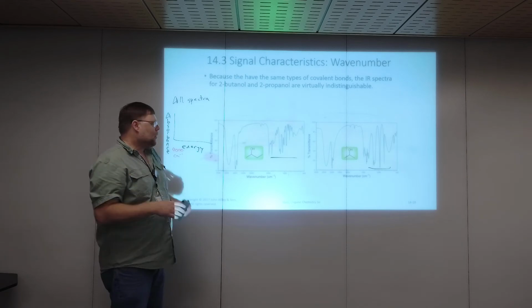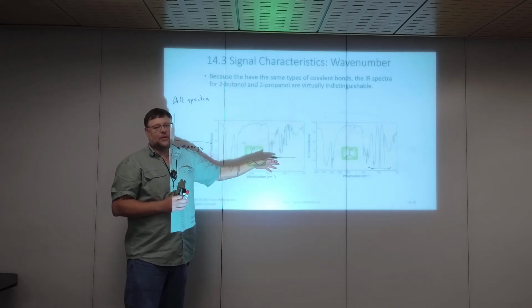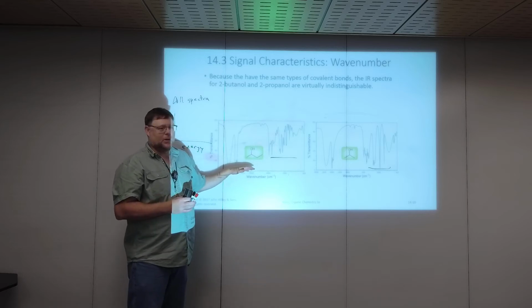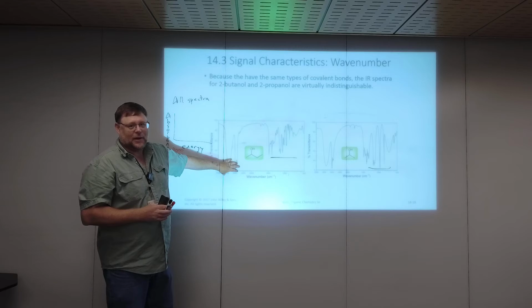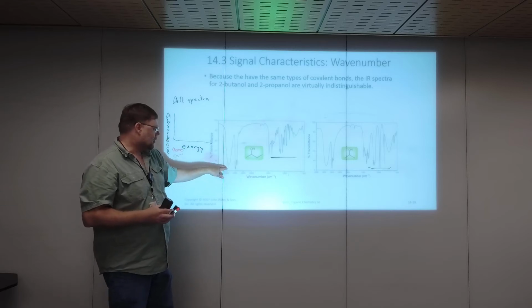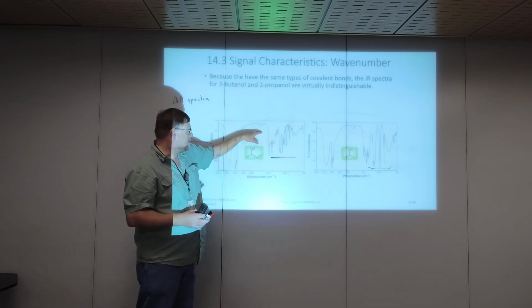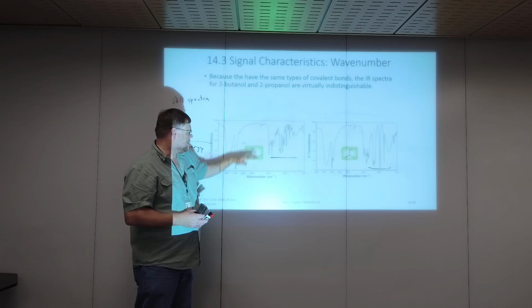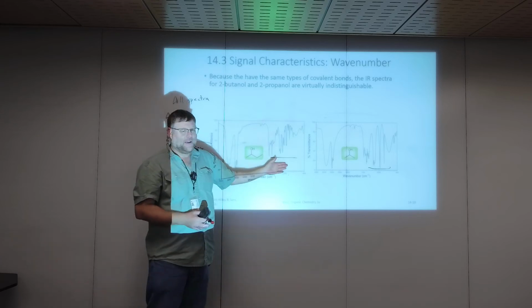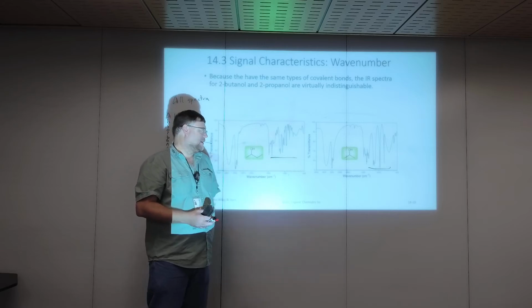So if you had a catalog of spectra, and you had an unknown that you thought might be one of these two, well, this region's not going to tell you much. Okay, it's an alcohol. It'll narrow down that you want to look at the alcohols, and it's got CH bonds. There's no double bond stuff. These are too weak really to be double bonds, so there's no double bond stretches. So you go into your catalog and you find a fingerprint region that matches, like a fingerprint in a crime scene.